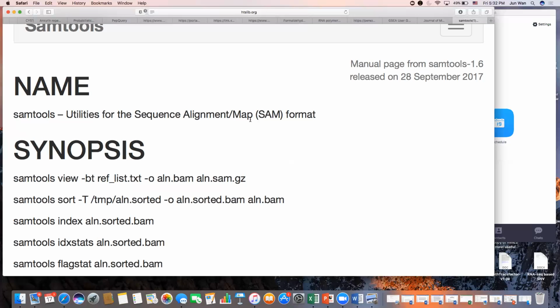All you have to do is load your module, type samtools space view -bS, your SAM file, greater than symbol, the name of the BAM that you want. I always go with whatever the sample is, so control or CTCF, so I can make my comparisons. So you're two-thirds of the way done in about 10 to 12 minutes. These are really efficient programs. They work really well. That's how hard it is to use samtools.